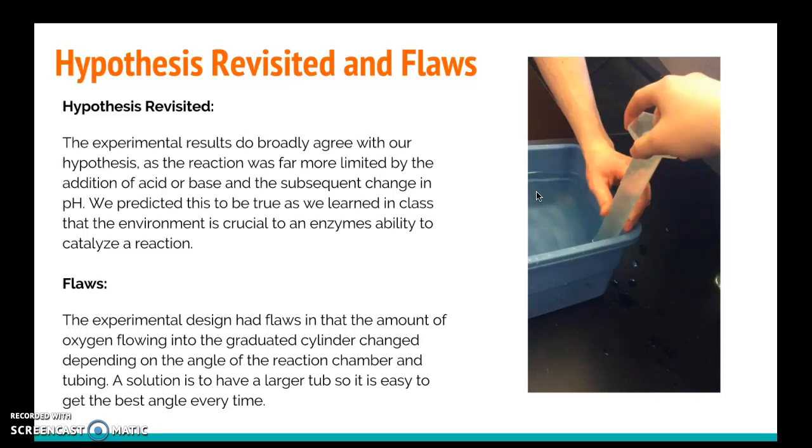Hypothesis revisited and flaws. The experimental results do broadly agree with our hypothesis, as the reaction was far more limited by addition of acid or base and the subsequent change in pH. We predicted this to be true as we learned in class that the environment is crucial to an enzyme's ability to catalyze a reaction. Flaws.